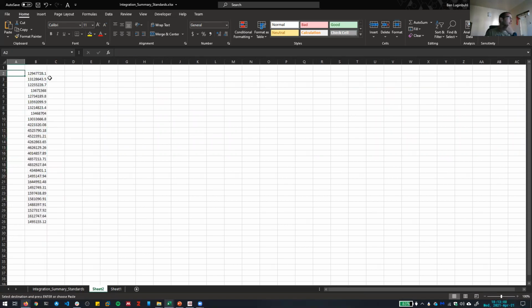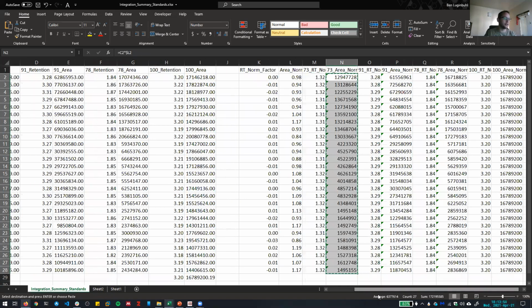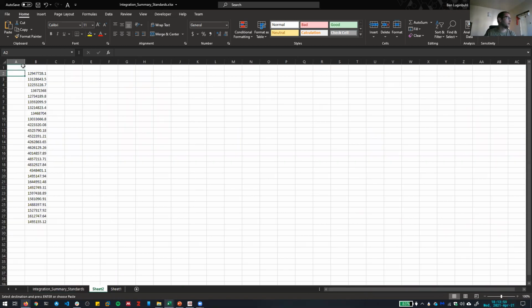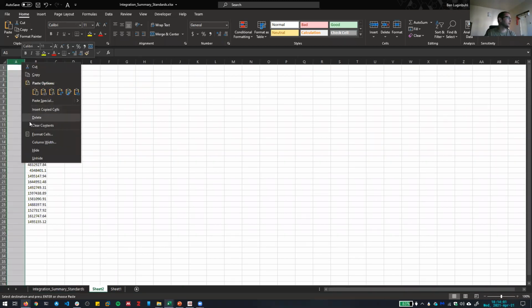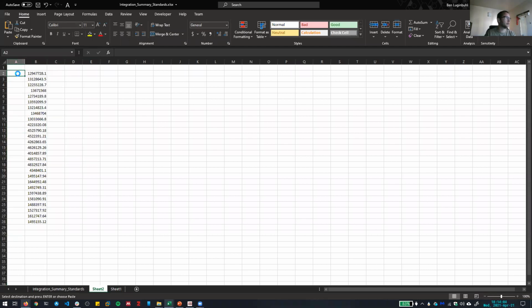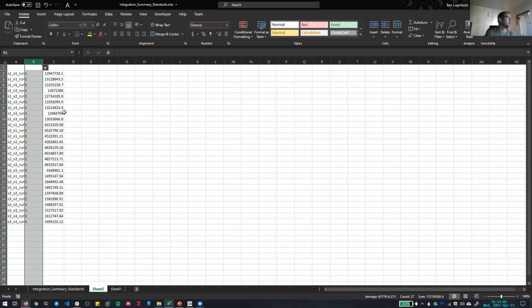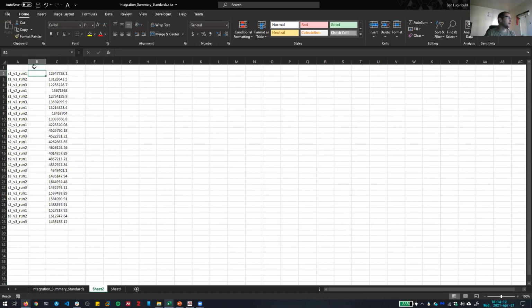And then, what do we put for the x-axis values for these different areas? Anyone got an idea? Let me also grab the labels for these, and I'll put them in here. We'll insert a column here. Okay, so we want concentration versus area, right?